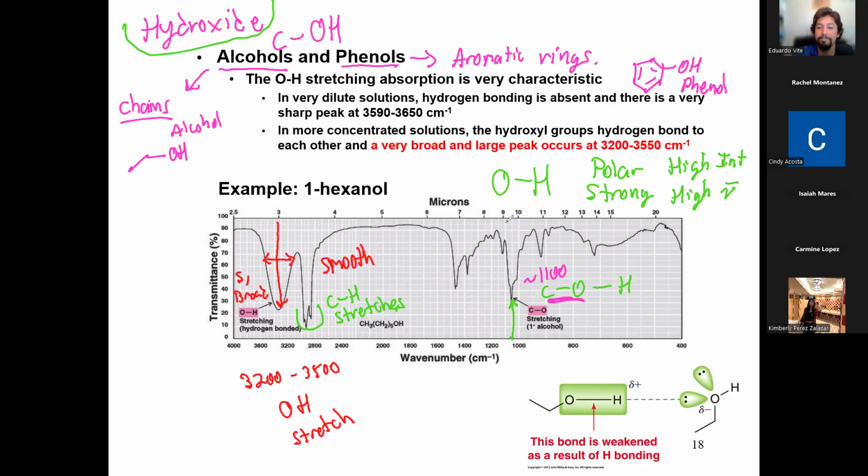It's nice to see. It's good practice, good training, but for now, for this specific example, it's not really useful. So really, the only thing you gotta look for is this signal here, the one between 32 and 3500. So any questions about the OH signals right here? This is spectroscopy. This is what the field looks like. And you're gonna do this with NMR next semester too.